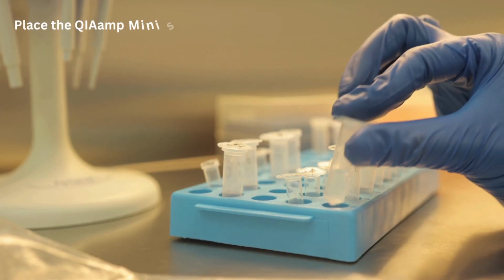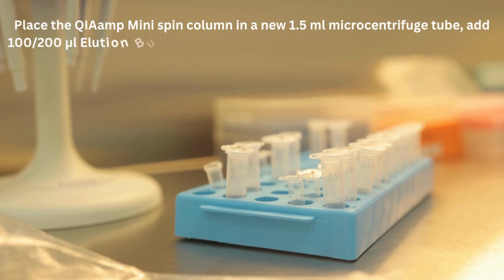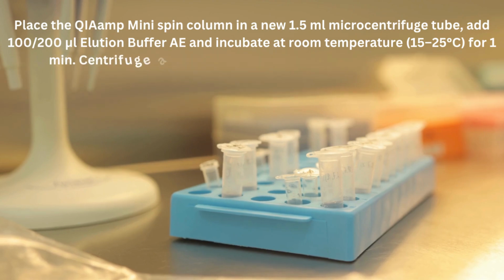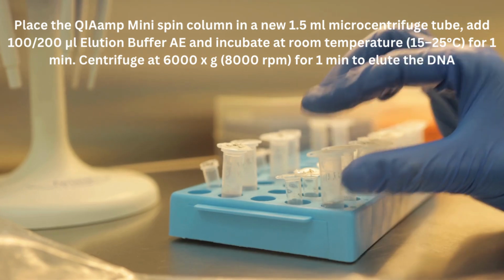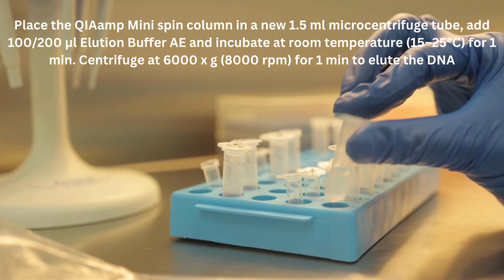Place the QIAamp mini spin column in a new 1.5 ml microcentrifuge tube. Add 200 microliters elution buffer AE and incubate at room temperature, 15 to 25 degrees Celsius, for 1 minute. Centrifuge at 6000 xg, 8000 revolutions per minute, for 1 minute to elute the DNA.